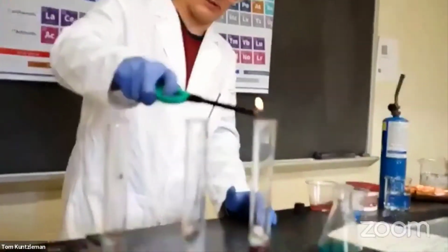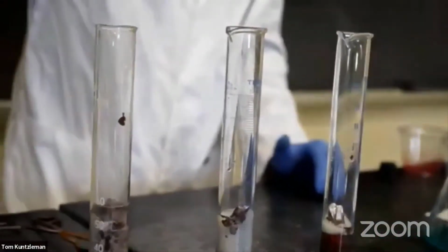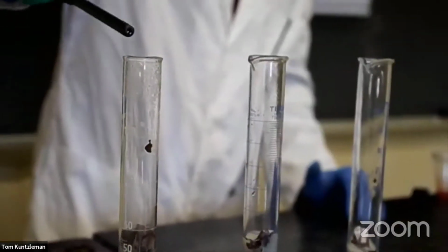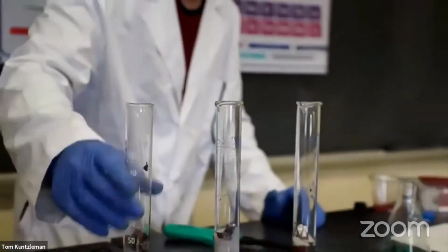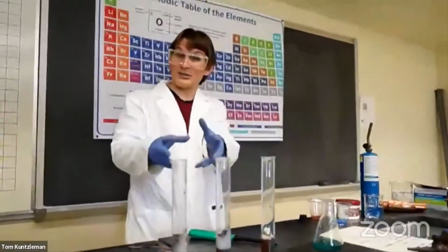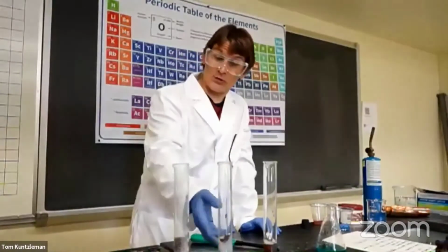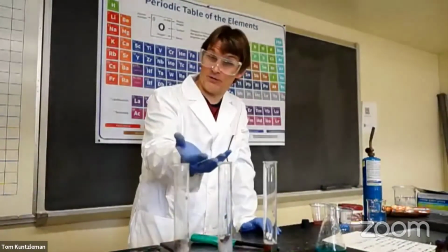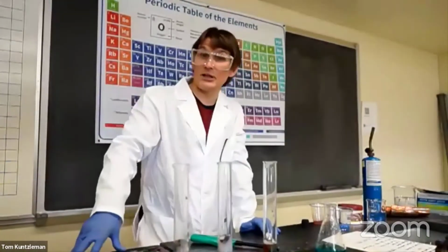See if we still got some here. Oh, I don't think that one's gonna work. And there's that one. Oh, that one's not either. I think we're out. Yeah, unfortunately, I'm not making enough hydrogen gas quick enough to get that reaction to go, but those tiny explosions that you saw, those were the reaction between the hydrogen gas being evolved and oxygen in the atmosphere, forming water and releasing a lot of energy.